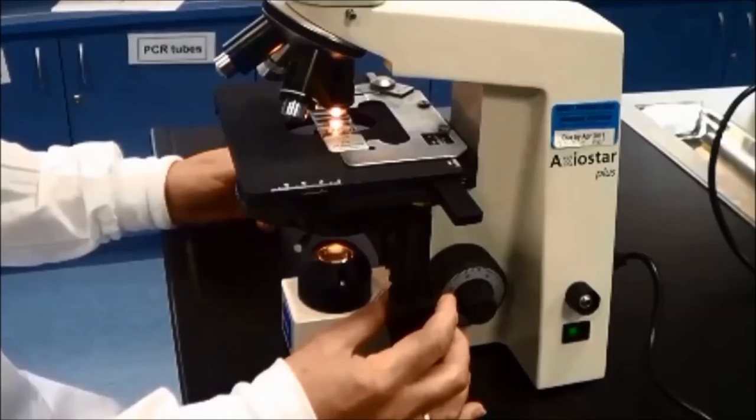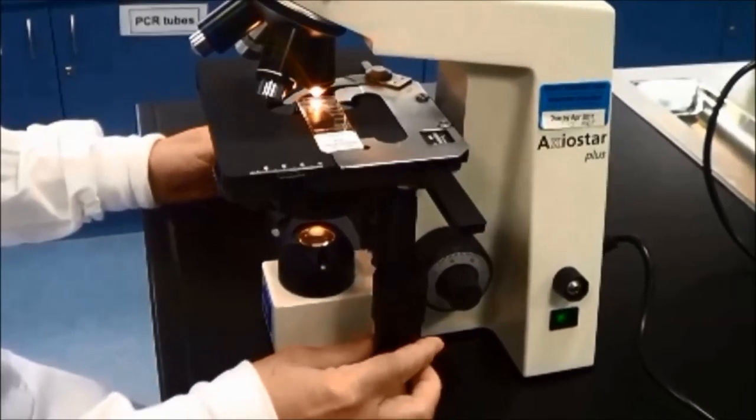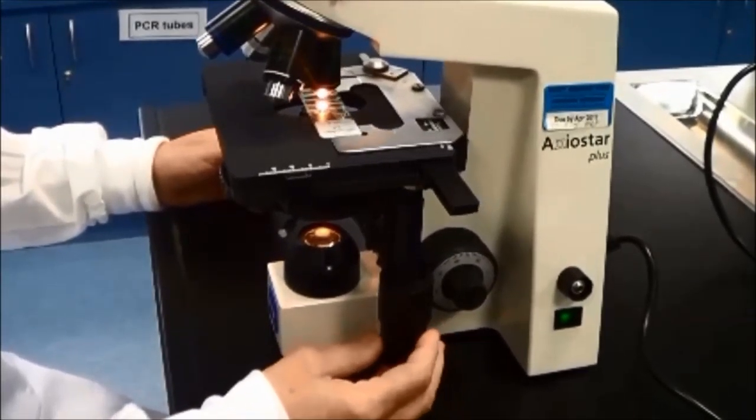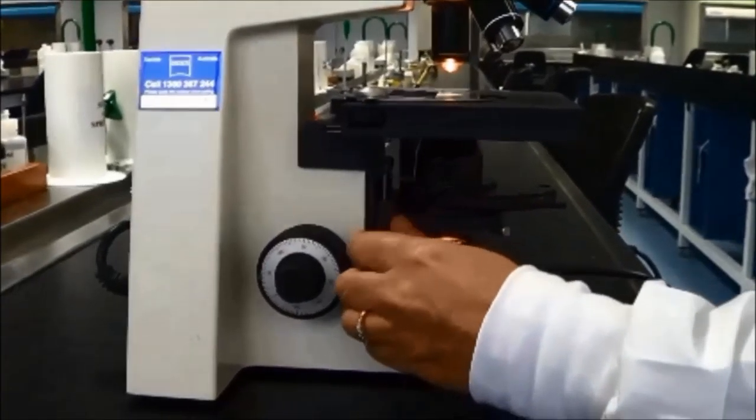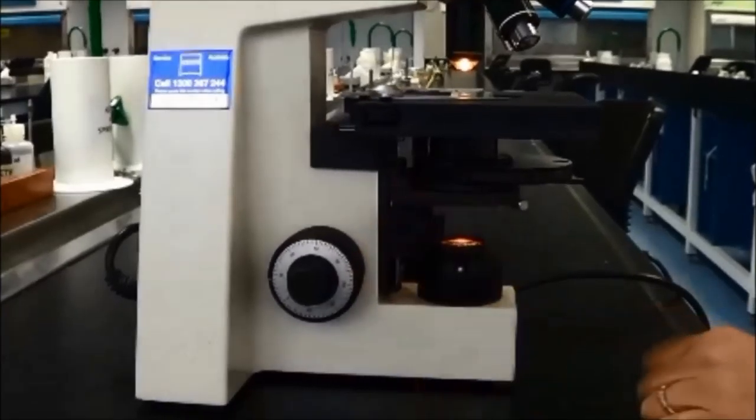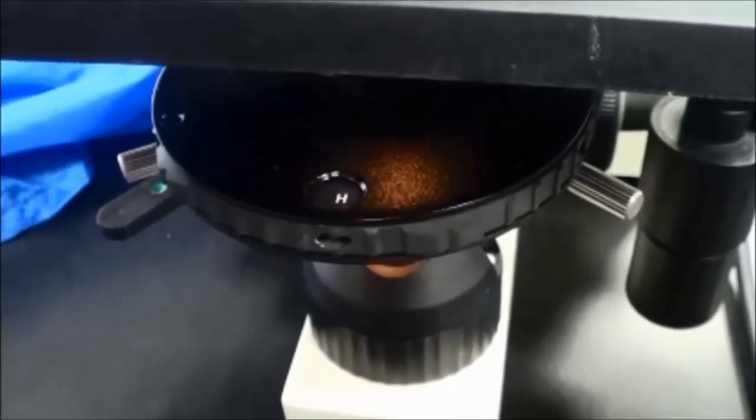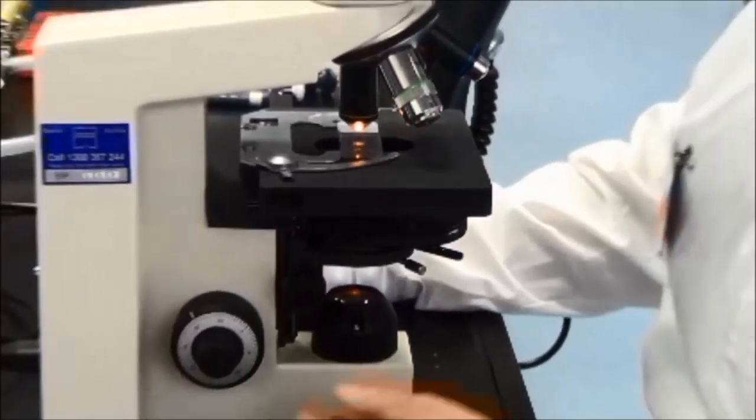Move the slide using the mechanical stage adjustment so the area of interest is in the field of view. Use the condenser adjustment knob on the left hand side of the microscope to move the condenser to the uppermost position. Ensure the condenser is showing H for brightfield.